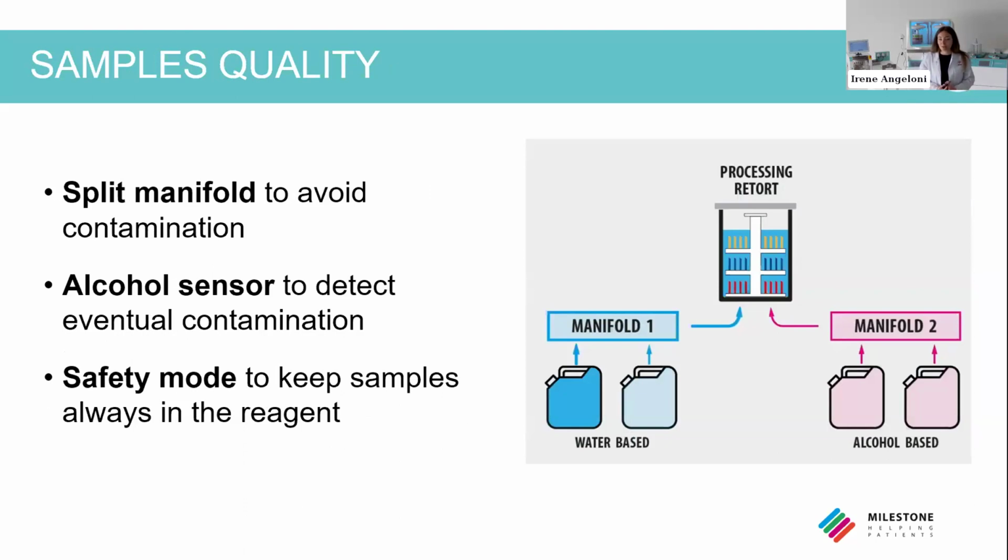So it's inevitable that the final quality, the quality that I have on the slide, is strictly correlated to the quality of the reagent itself. I think that you can agree on this. And from our direct experience, the contamination between reagents, in particular with the water-based ones, is what gives the most problems during the evaluation of the slide.